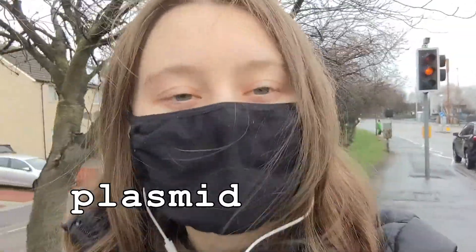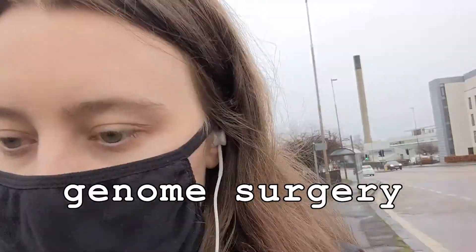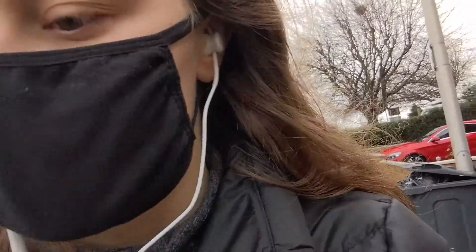Genome editing tools like the ones I'm working with come in plasmid form — the plasmids contain my tools for what I'm now calling 'genome surgery.' I prefer that term over 'editing' because we're making literal cuts; just as a surgeon can make mistakes, so can a scientist. The plasmids arrive inside bacteria, so my job looks like growing normal bacteria, then extracting the plasmids to get my tools out. I expected it to take 20 minutes, but because of that delivery it took about two hours to streak them onto agar plates. Tuesday has been surprisingly productive.